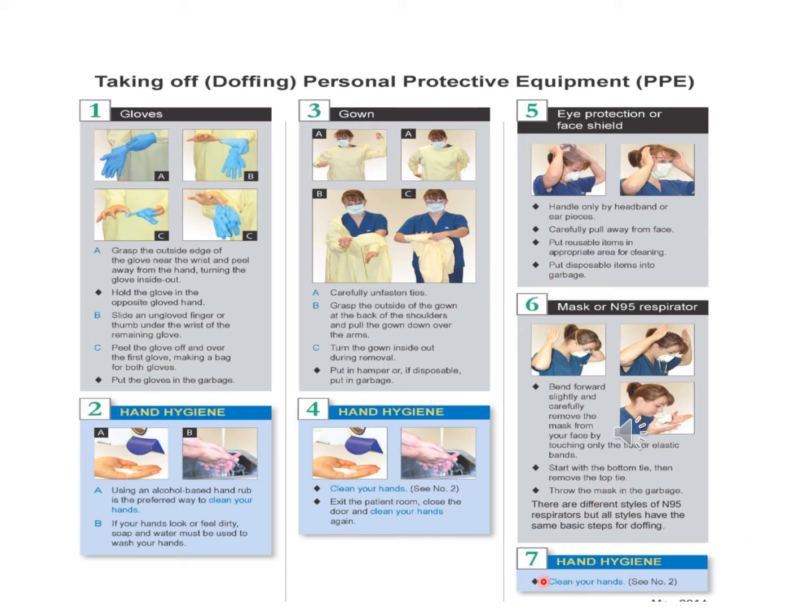And finally again you should wash your hands and apply an alcohol based hygiene solution, such as 70% ethanol or any alcohol based solution available in the labs, and also follow the rules to wash your hands.